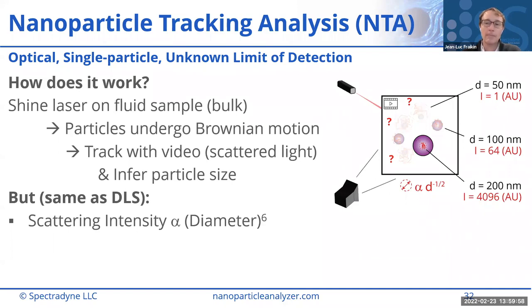So my first response would be to try without pre-filtering and just rely on the cartridge technology to do that for you. The filter cutoff for a C400 cartridge would be about 400 nanometers and would stop anything bigger than that from going through. Does that make sense?